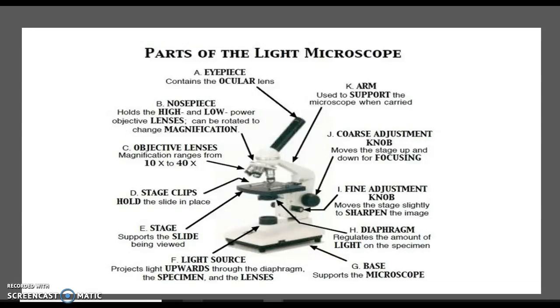Introducing our suspect today, Mr. Light Microscope. We will discuss the parts of the microscope. It's labeled here A through K. We will cover them, but we will not necessarily go in order.